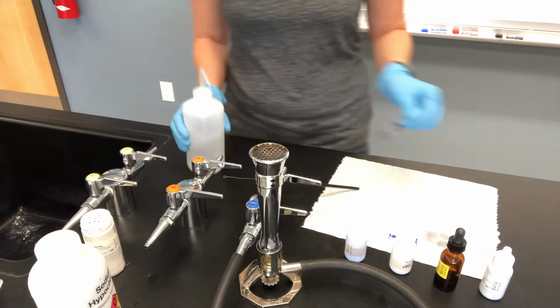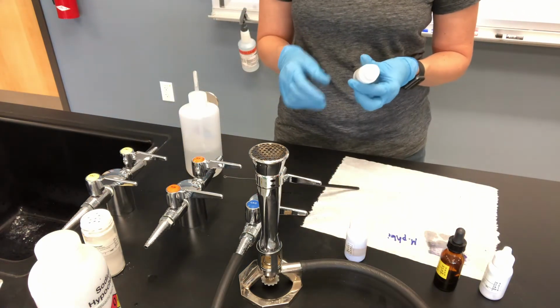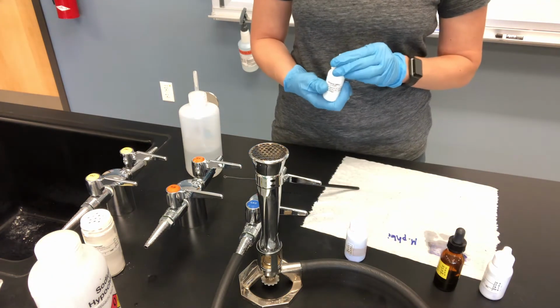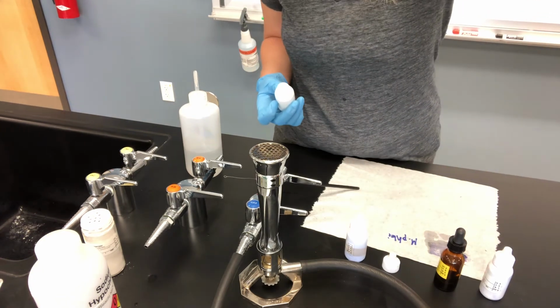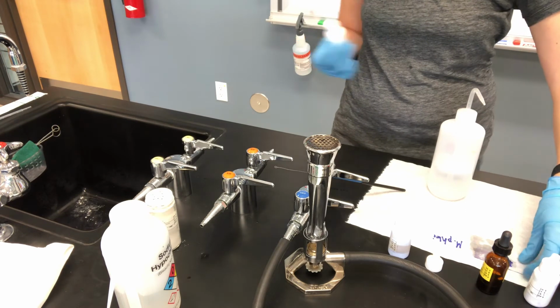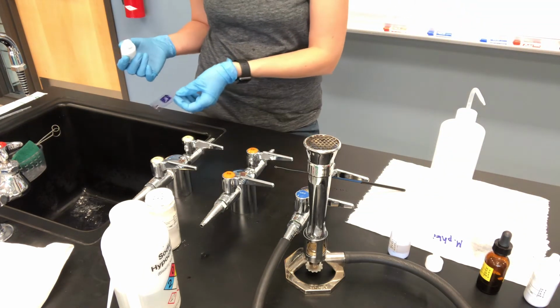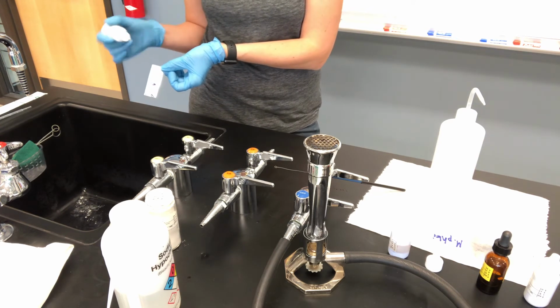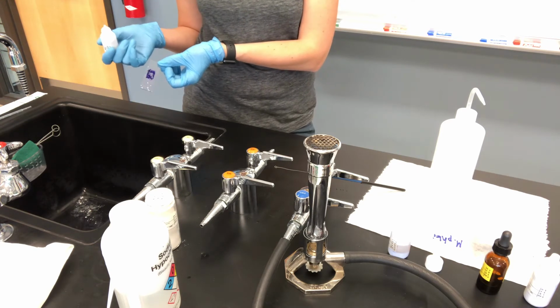Okay. The next step is probably the most tricky step of gram stain. This is your decolorizer, it's ethanol. We do not sit the ethanol on the slide for a long period of time. What we do is we hold the slide at an angle. Make sure you have your water ready. This is why I only recommend you do one slide at a time, because the timing is very important. You hold your slide at an angle and then you run the ethanol over the smear until what drips off is kind of a pale pinkish color.